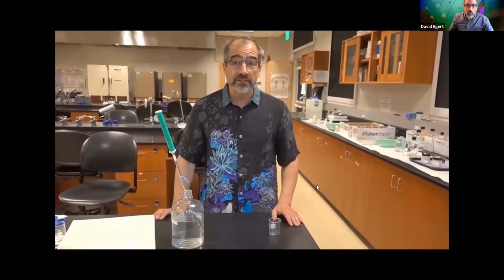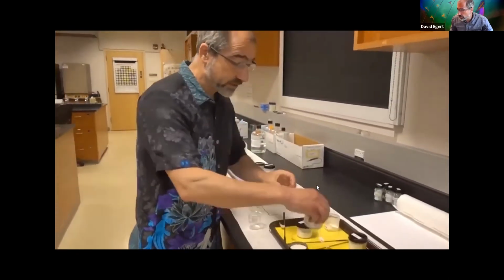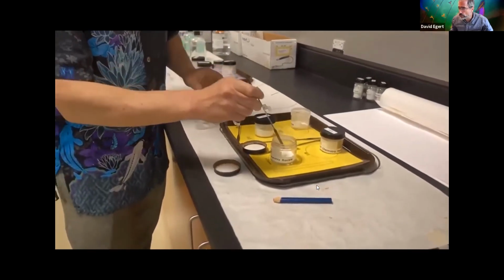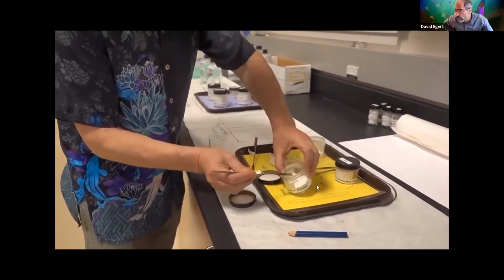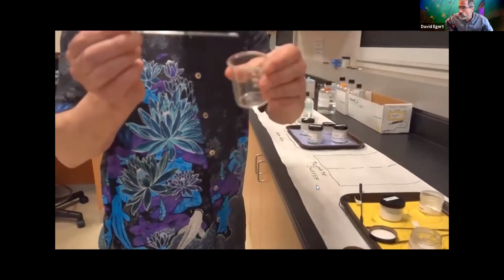All right, so now we're on part 3 of the chemistry review lab, which is basically the same thing as part 2, except instead of using an electrolyte, we're using a carbohydrate, in this case, glucose. So I'm going to get my little 50 ml beaker, and I'm going to put a pinch of glucose in there. I find the appropriate labeled glucose spatula. One pinch of glucose. There's my pinch of glucose, my beaker, put it in.